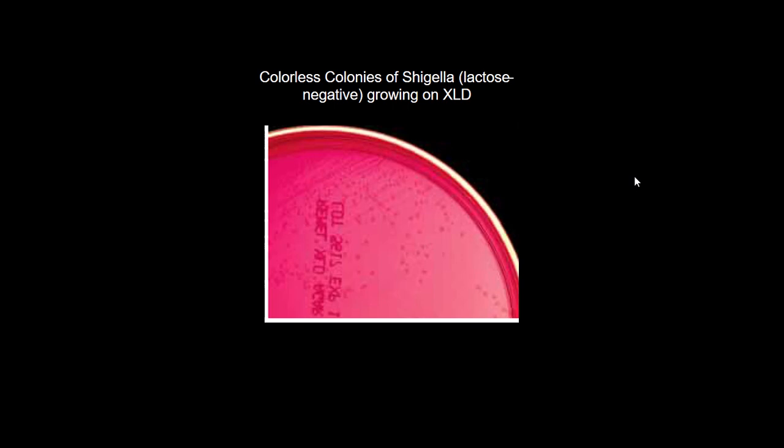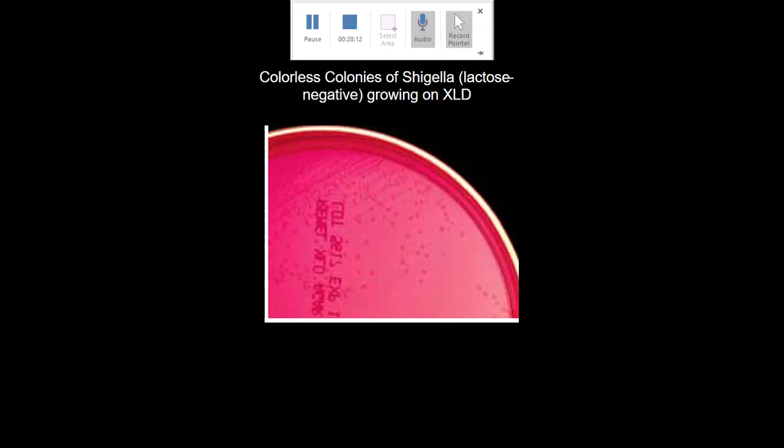So for the rule of thumb, you have to remember that in most of the media that we use for the isolation of those pathogens, you look for the lactose non-fermenters. Very, very important to remember that, whether on MacConkey, XLD, or Hektoen enteric media, remember lactose non-fermenters.